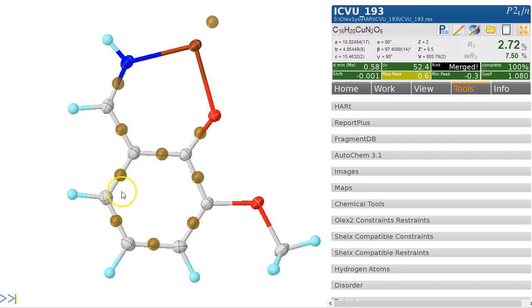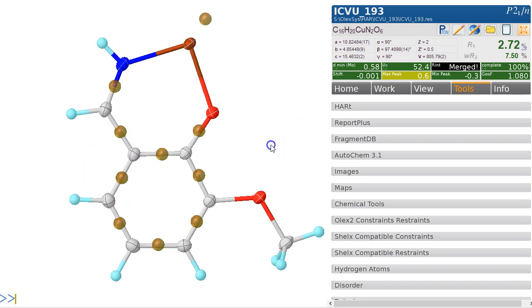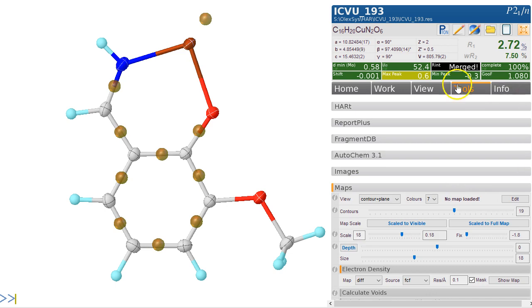We can visualize this slightly differently by going over to the maps area in OLex2. This is in Tools > Maps. We're looking at a difference map. We're not actually aligned here.